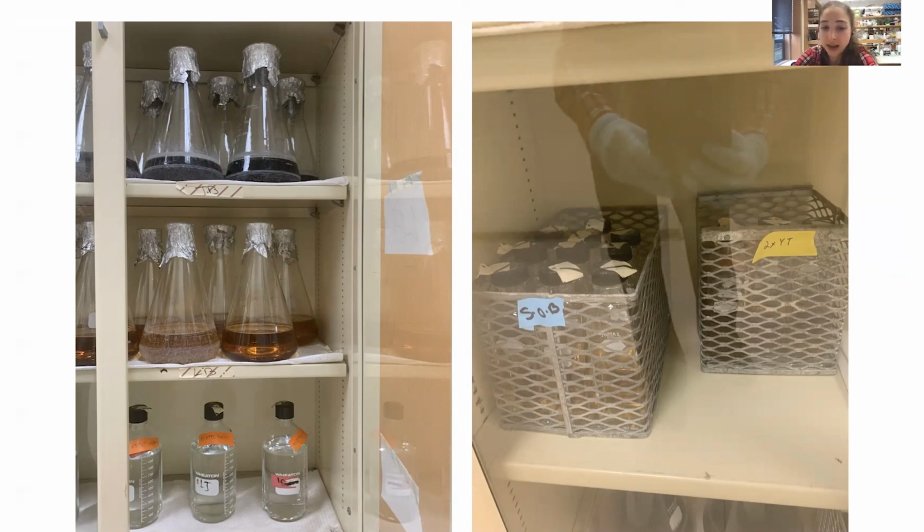So if you have glucose in your media, that can cause caramelization reactions where the glucose is reacting with itself, or you can have Maillard reactions, like browning reactions with meat, where you have the sugar reacting with protein. And so you can get these color changes to happen. It also depends on what's in the media and how long it autoclaves for. But don't be worried if you see that this one's a little darker than this one. That's all that it is.